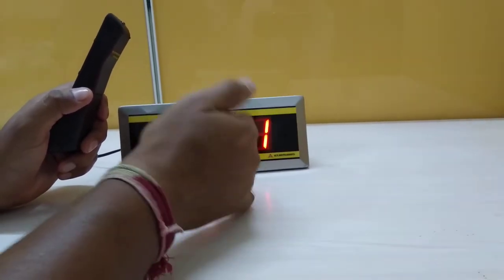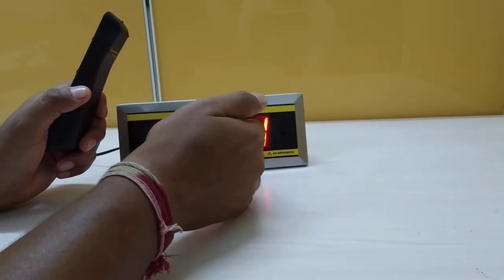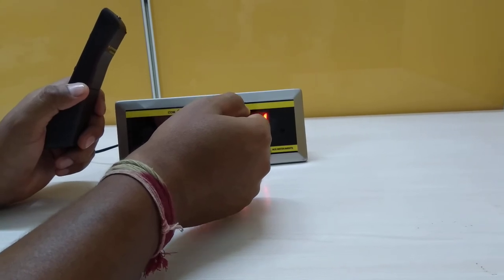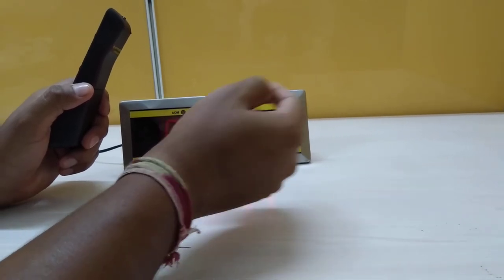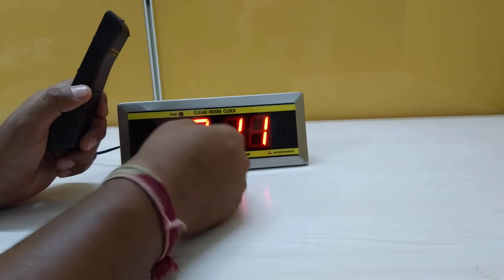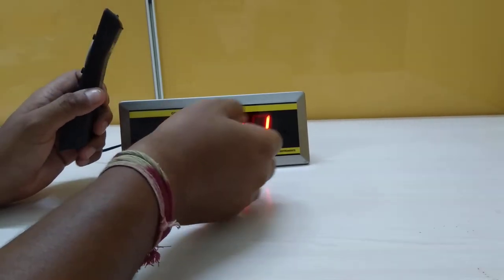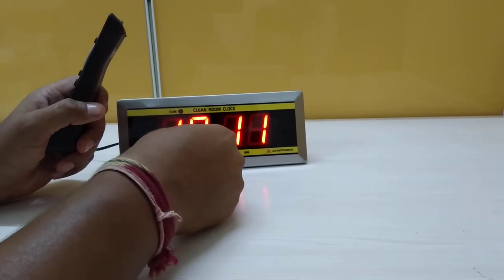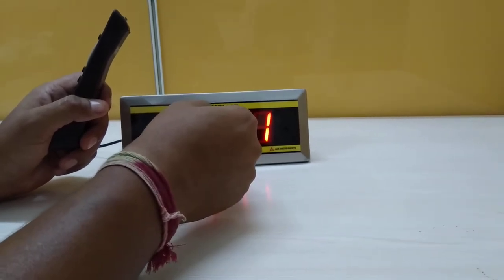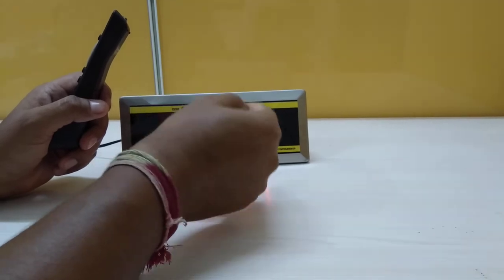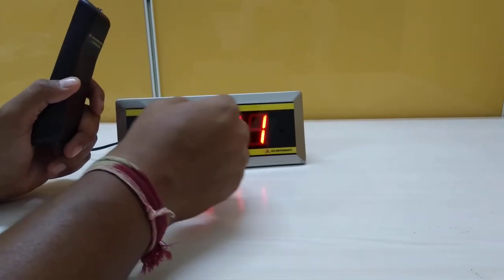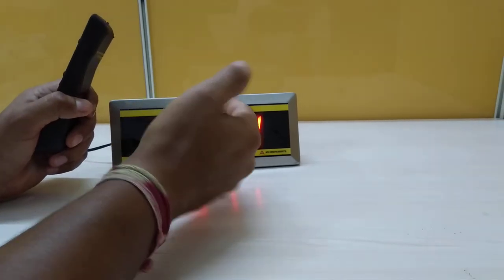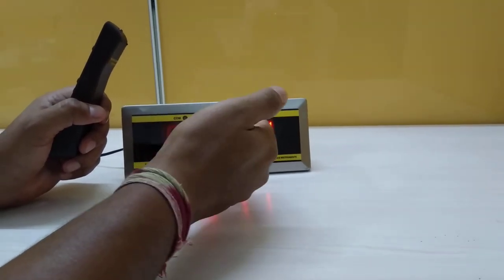In the synchronized model, we have both options which are wired and wireless. The wireless basically works with RF technology, and the wired one works with RS 45 communication. We have a software that can be installed in the server to get the synchronization done. In synchronization clocks, both wired and wireless, we have 2.5 inches and 4 inches options.